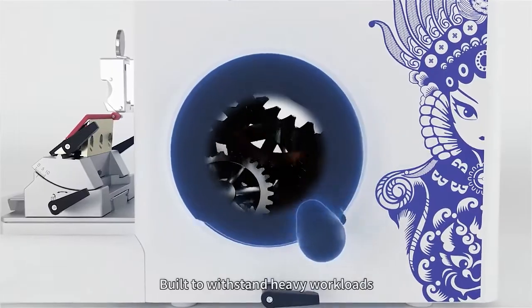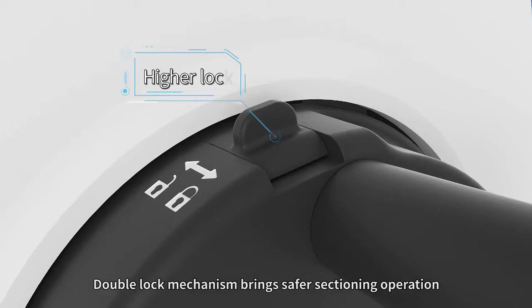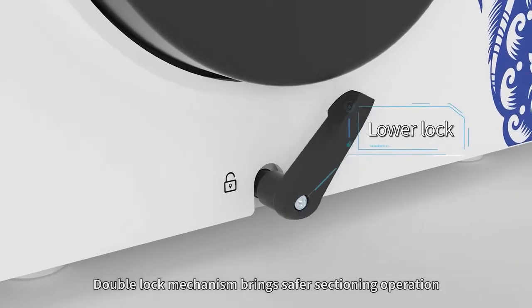Built to withstand heavy workloads, the double lock mechanism brings a safer sectioning operation.